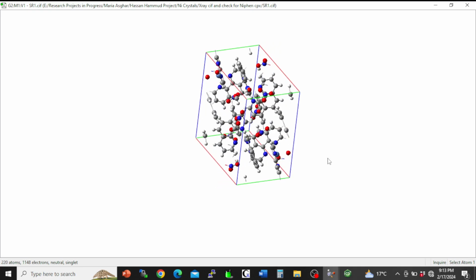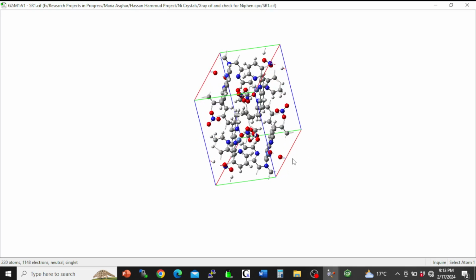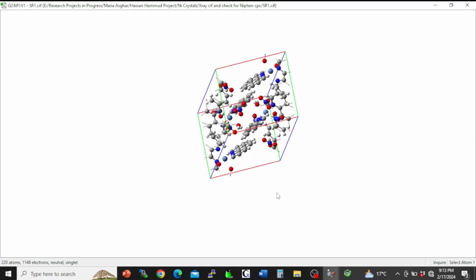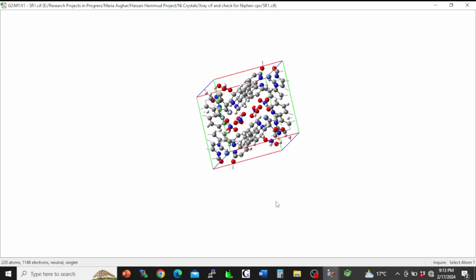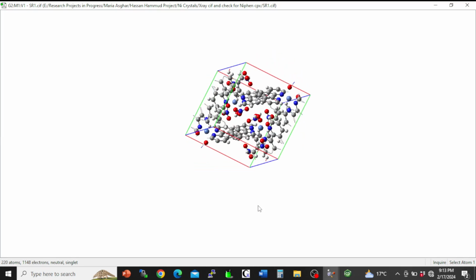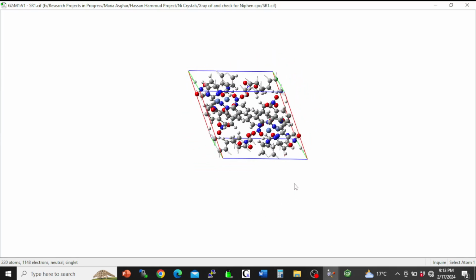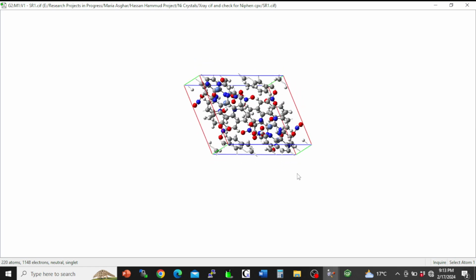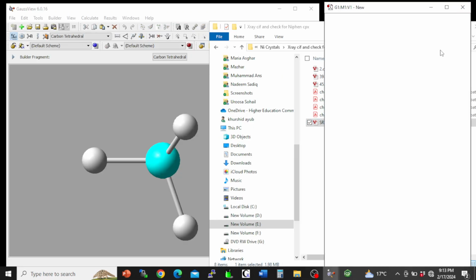And especially if you're a beginner or not really expert in reading CIF files, probably you will not be able to understand what molecule this one is because it is not easy to find exactly what the molecule is. And having this type of file in front of you is not helping you, but it is creating problems or confusion for you. Generally, we work in two-step process to open up a CIF file.